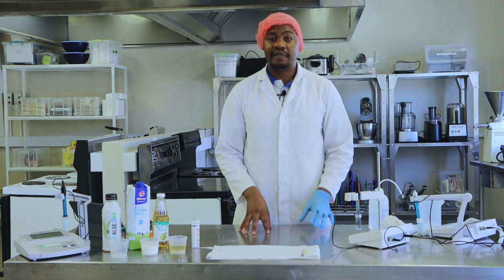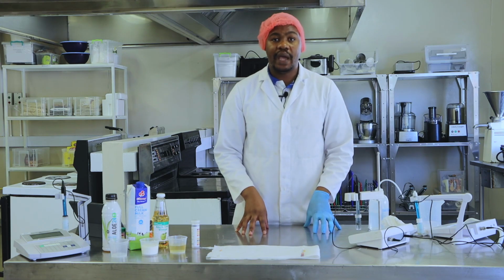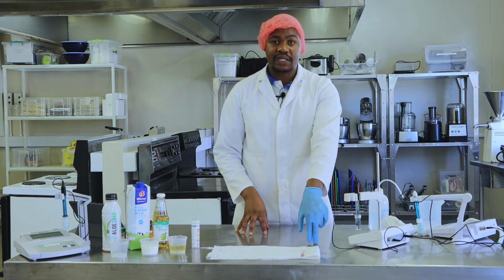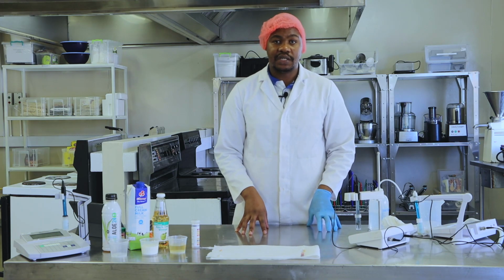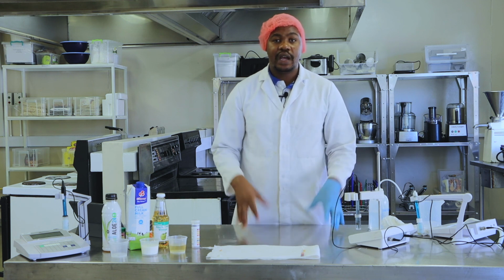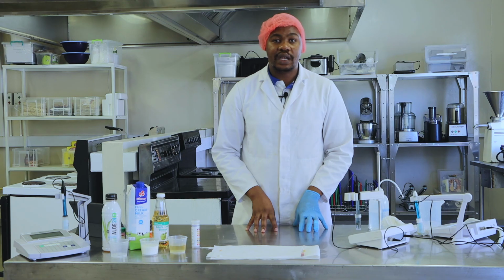At an advanced level, you do have specific pH probes that can be used to measure the pH of meat and also the pH of cheese. So that's it for today's practical or for today's demonstration. Then you have to go and watch and complete the practical test, which is going to be on Blackboard. Okay.